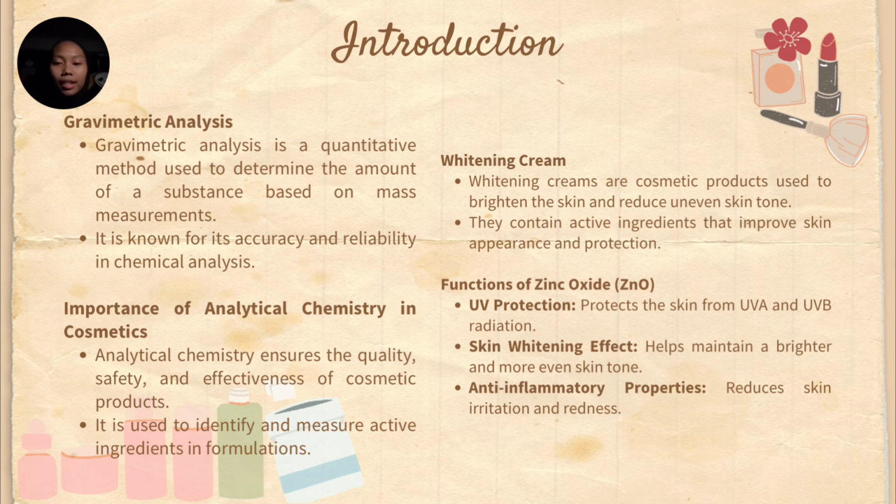Analytical chemistry plays an important role in the cosmetic industry. It helps ensure that cosmetic products are safe, effective, and of consistent quality. Scientists use analytical techniques to identify and measure the concentration of active ingredients, detect impurities, and verify that products meet regulatory standards. This process helps manufacturers produce reliable products while protecting consumer health.